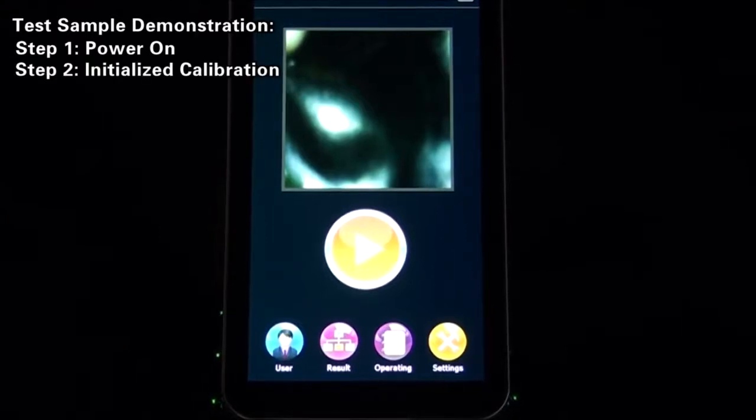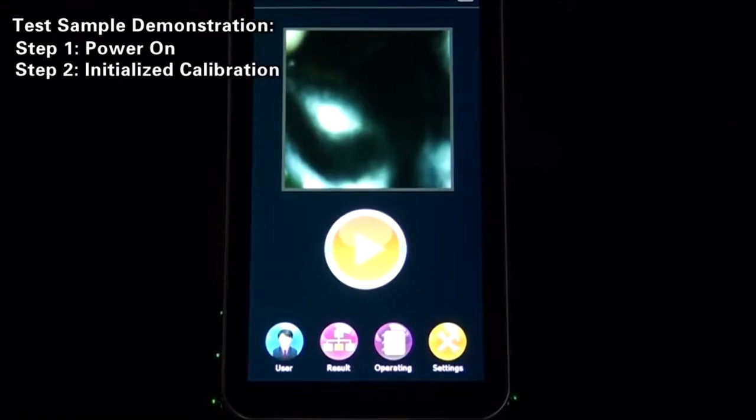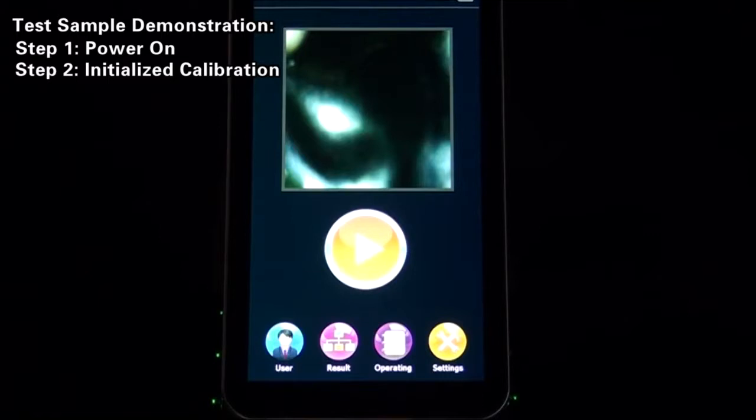Step 2: Initialize the calibration. In the event that the instrument is used for the first time or reused after it is put aside for a long period, complete the initialized calibration. Generally, it is okay if there is one time for initialization for each week.